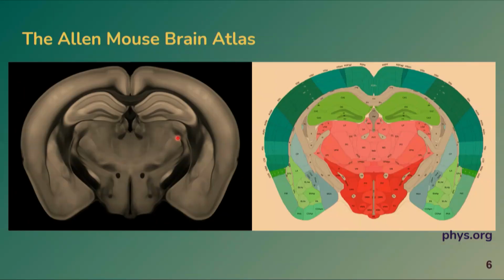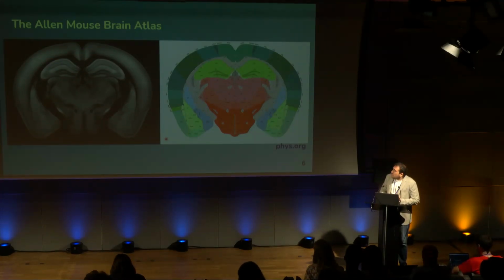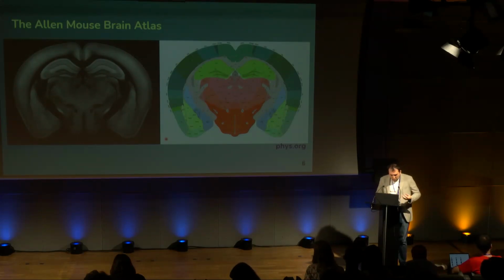So here we have an image of the brain of a mouse, which in spatial transcriptomics is our iris dataset. Like in data science, we have the iris dataset, the beginner's dataset; in spatial transcriptomics it is this one. And why? Because it's a very well structured organ which we can use to study biology and explore its areas.